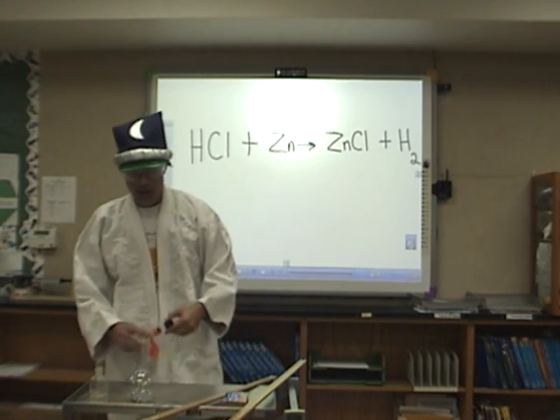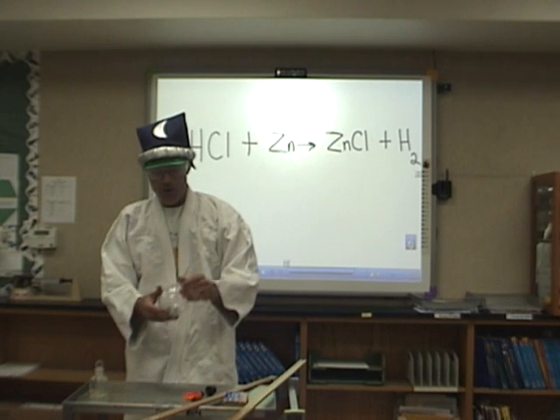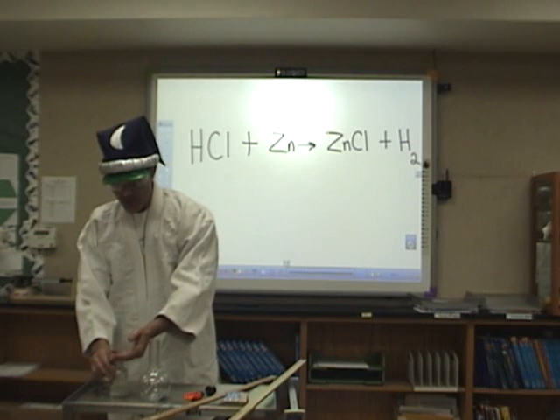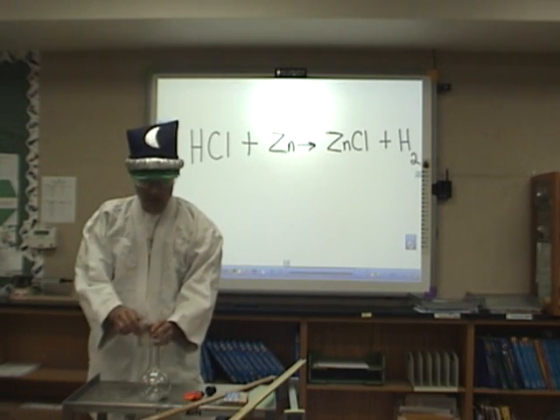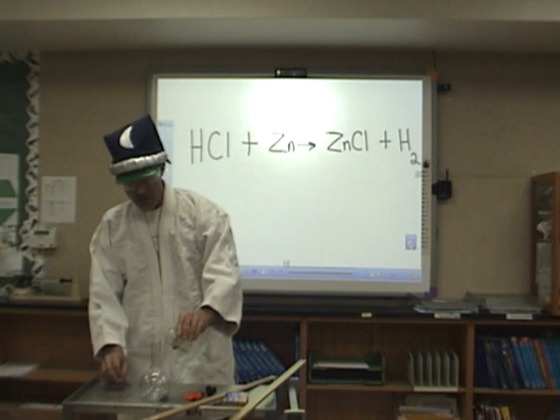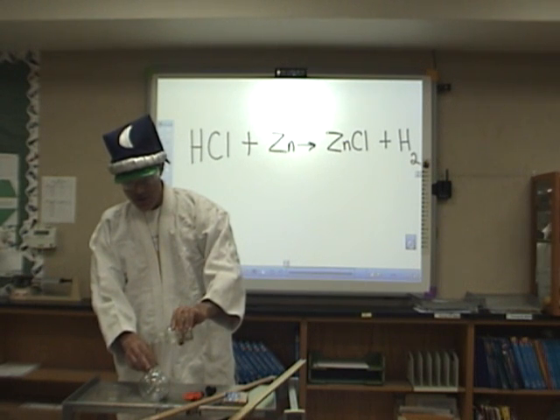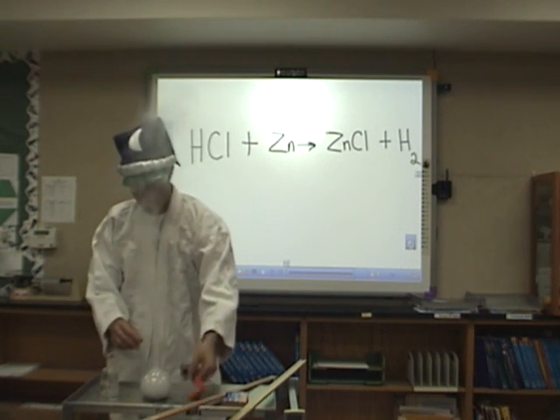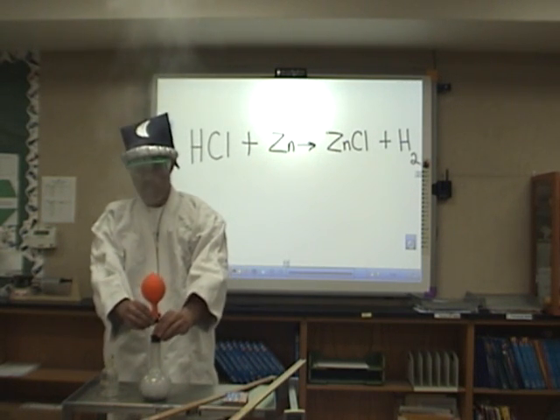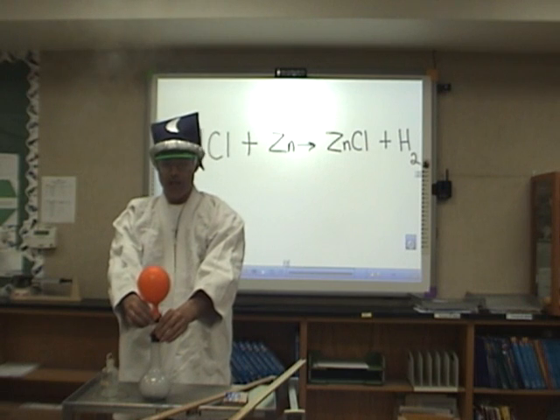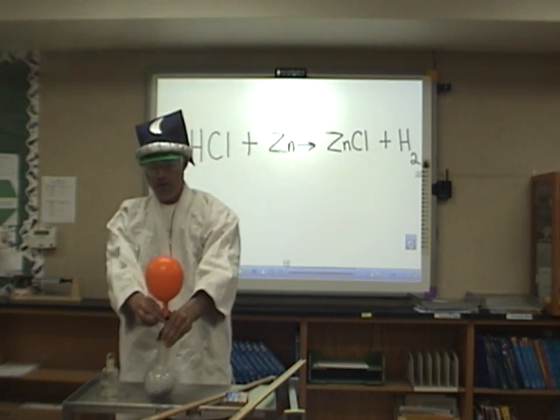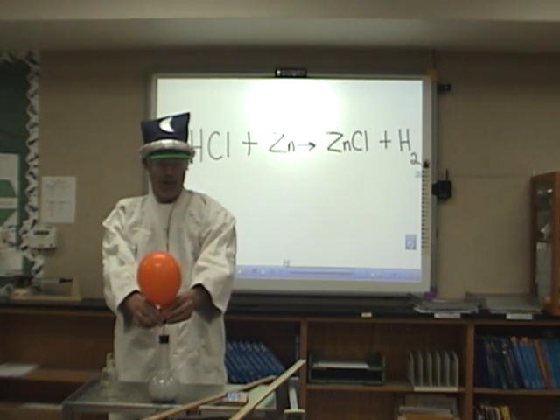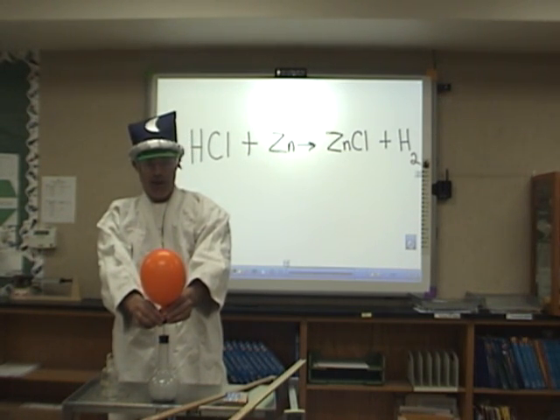We're going to collect some hydrogen gas, and to do that we already have in this Florence flask some zinc. Then we're going to add the hydrochloric acid by taking the glass stopper off the reagent bottle and pouring that into the zinc. The reaction begins running. We're collecting the gas inside the balloon. It's an exothermic reaction so it gets a lot warmer.